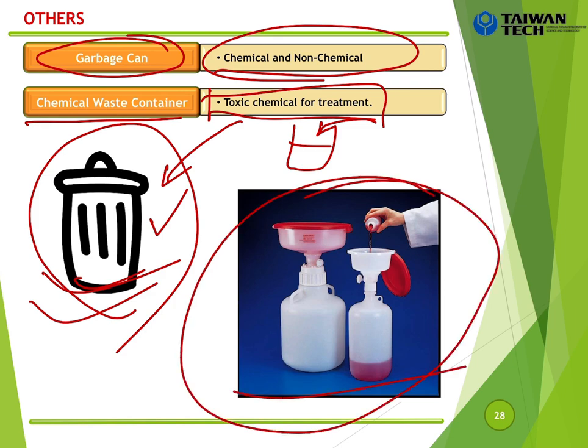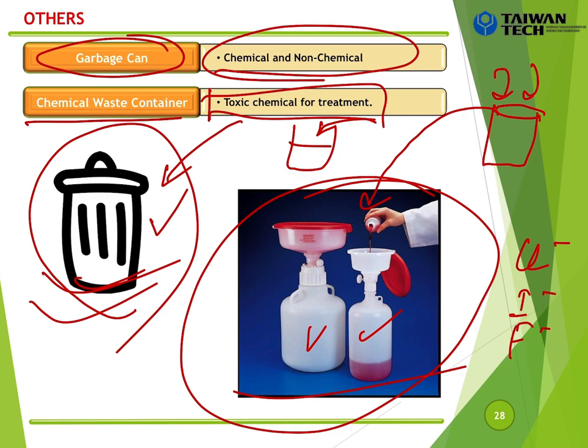And for the specific container here, in the lab I will ask the TA to prepare maybe some beaker for you, and you may add that one inside, and later when we finish the class, we can put it together into this one, because we don't have only one kind of bottle, we may have different kinds of bottle, maybe for the heavy metal, or maybe for some kinds of ion that will be together in one container, and if you have the heavy metal or something like this, it will be for another container. So we have different treatment as well, you cannot mix together.